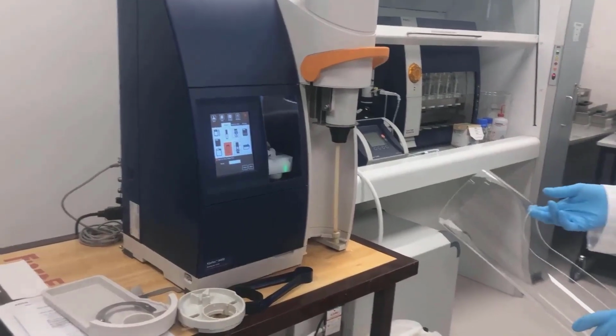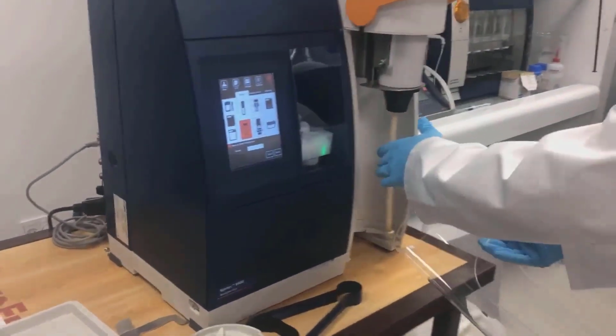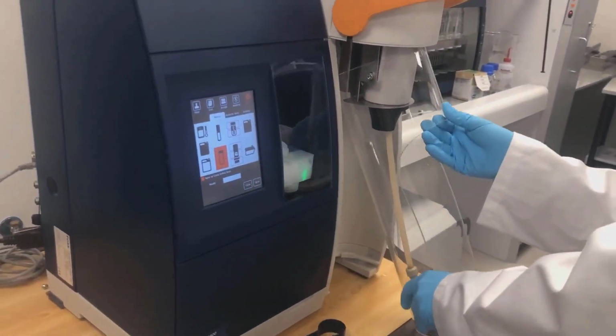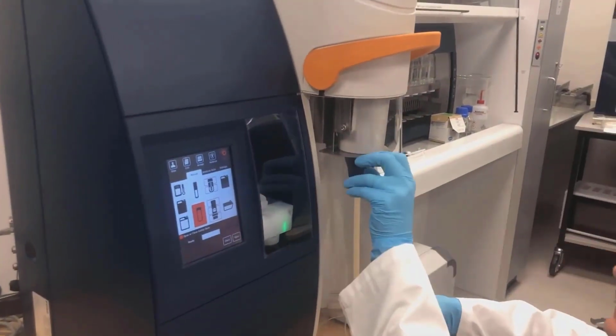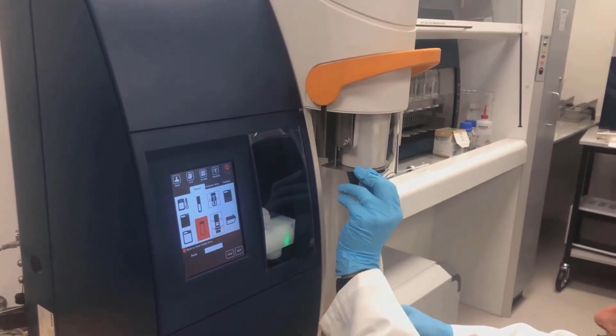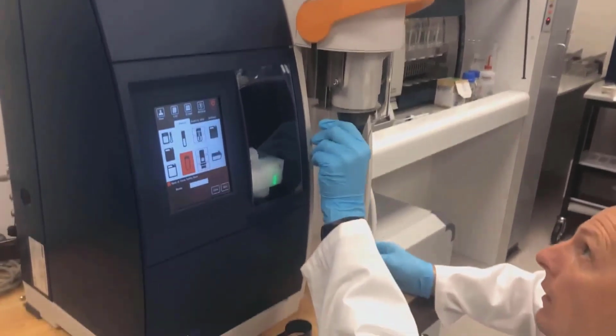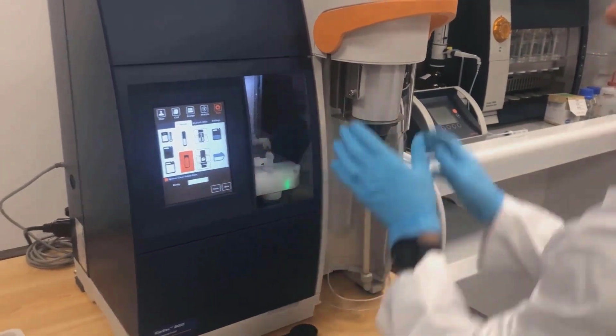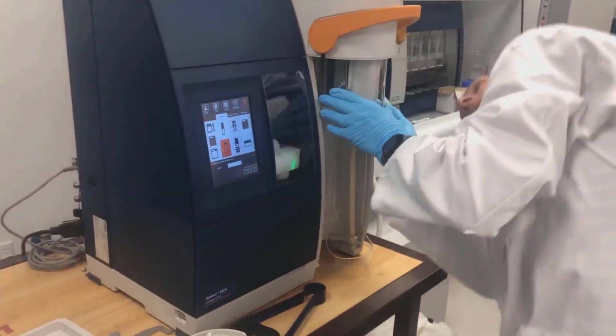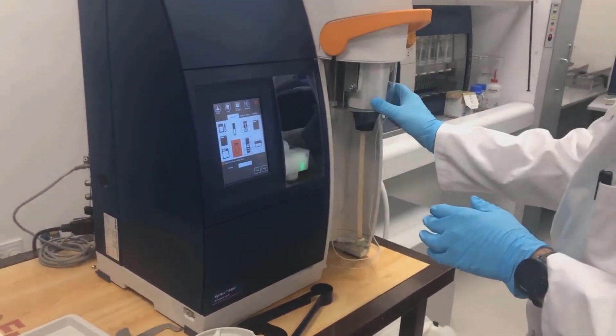Okay, now we just put back the safety door. There's a slot you can slide in. And lift the safety door a little bit up. Then you can put it in the right position. Check if it's in place. Yeah.